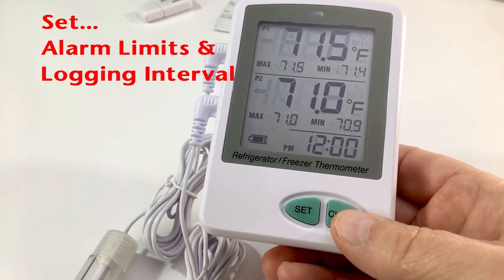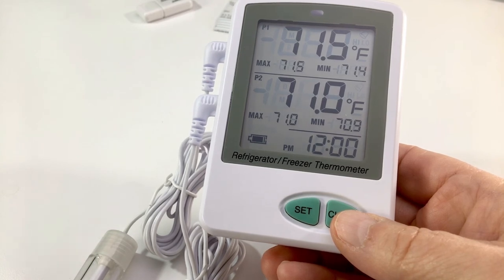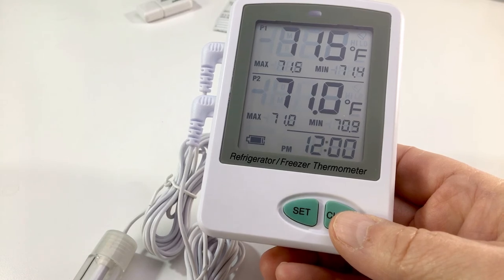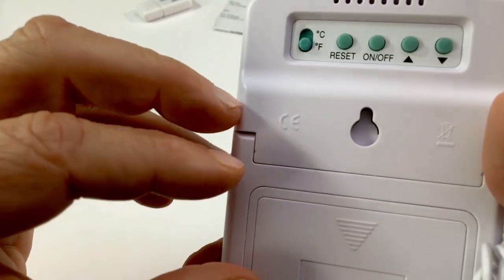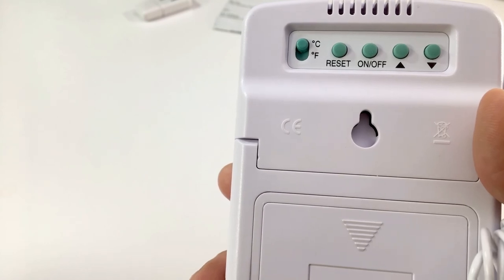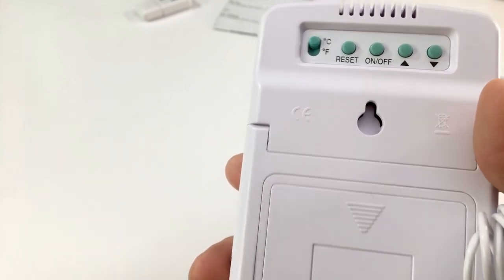Before we set the min/max alarm limits, we need to decide what temperature scale we want represented in our reports and on the display. I prefer Celsius, so to change from Fahrenheit to Celsius, turn the unit over and move the selector switch from F to C for Centigrade. If you prefer Fahrenheit, just move the selector switch to the F position.